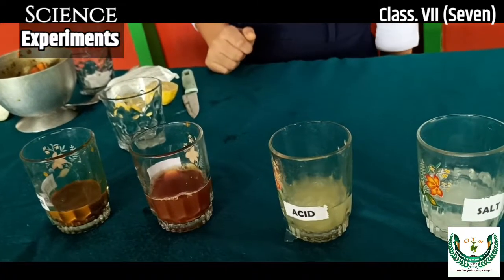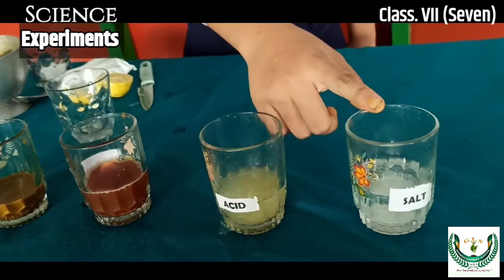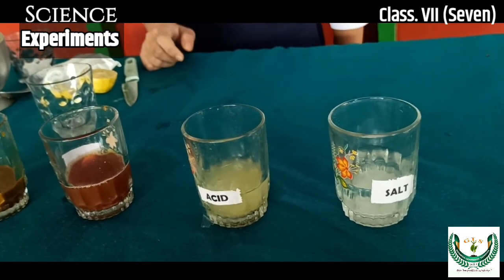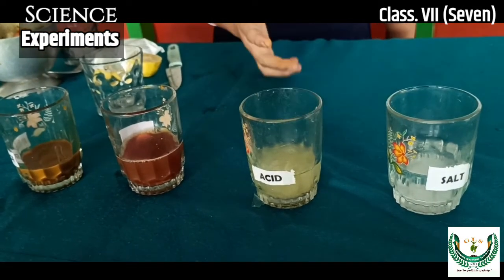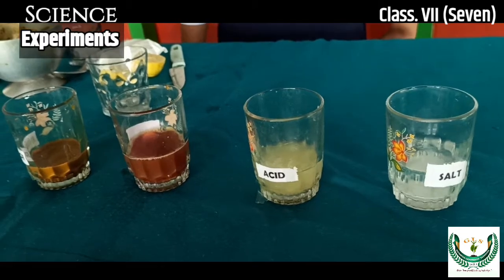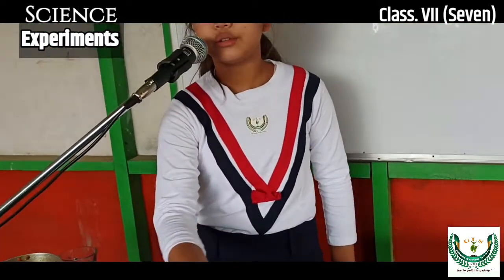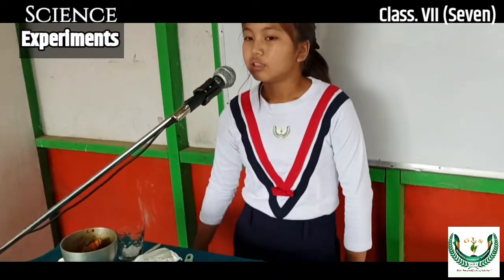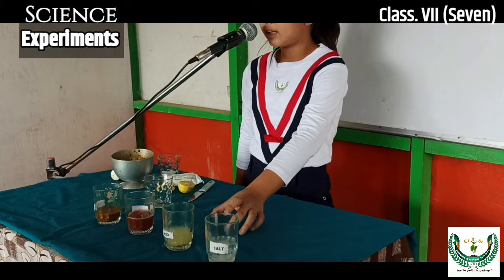Now let's move on to the next liquids, which are lemon water and salty water. When we add turmeric indicator to both liquids, the color becomes yellow. So it is a problem, because the color of both acidic and neutral turns yellow. How can we differentiate between acidic and neutral?